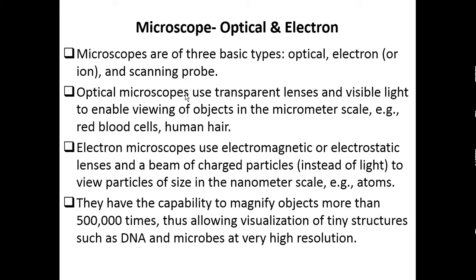That you should always understand. Optical lens is used for optical microscope, but for electron microscope, the image is formed with the help of an electron beam.